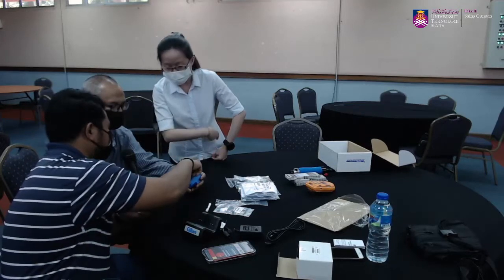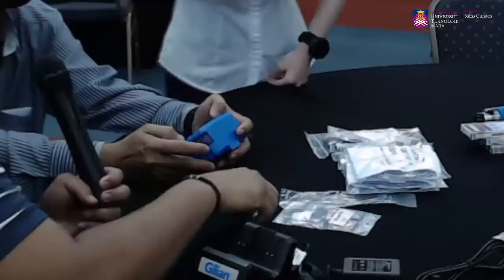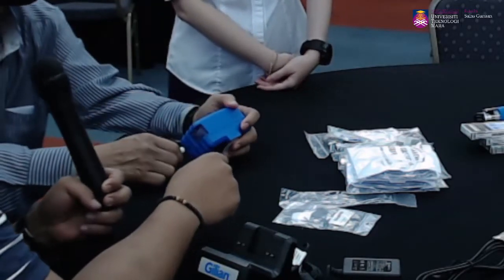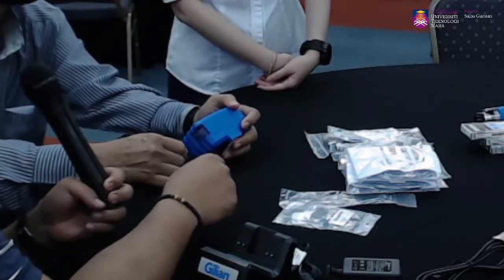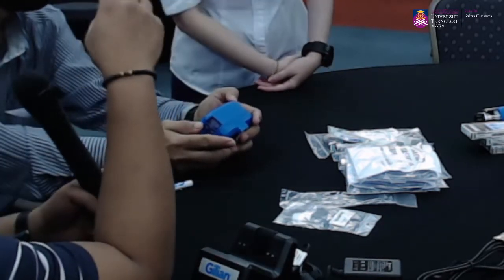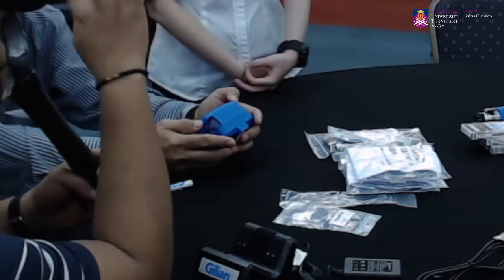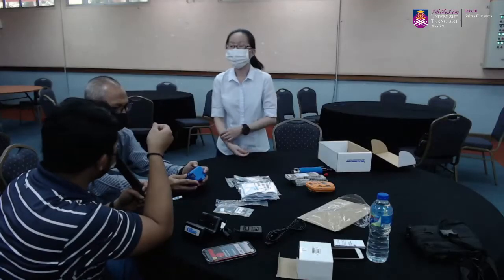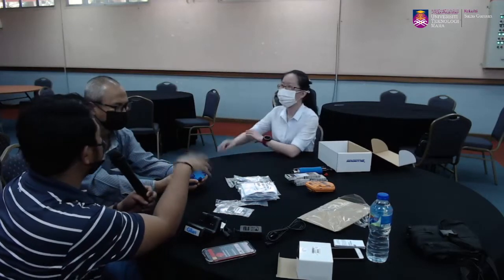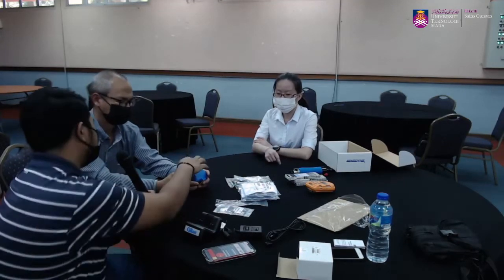Okay, kalau nak check kita just tekan ni untuk bagi dia light up screen. Okay, kalau nak tukar balik high kita just masukkan balik screw ni dia punya answer key ni, dan kita turnkan sampai dia high balik. So once dia dah high, dia buka error. Kalau error means that kita tak habis pusing, dia in between. So kita just pusing sampai dia click, and then dia tunjuk high, dah consider dia dah betul flow rate tu, tak ada masalah. So kita just nak kena tahu kalau contohnya flow rate bawah daripada 450 cc, kalau sini 450 ke bawah, then kita kena tukar kepada low.